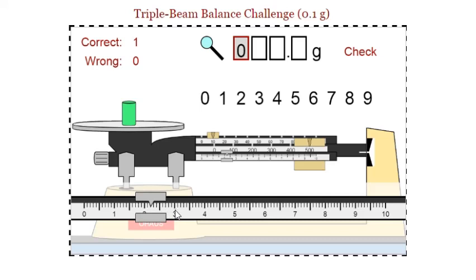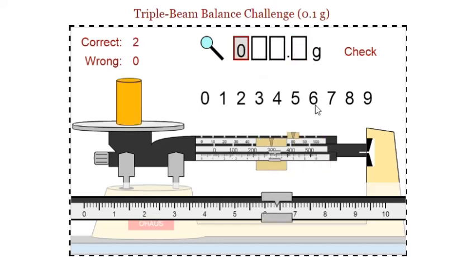So I'm quite confident that my mass value is 510, and then we add two, so 512 - at least it's somewhere between 512 and 513. Each mark represents 0.1, 0.2, so it's 512.2. Let's see if we're right: 512.2, check it, and we are correct. You can continue to get more practice doing this. This is what you would do in reading a triple beam balance to find the mass of an object in a traditional lab setting.